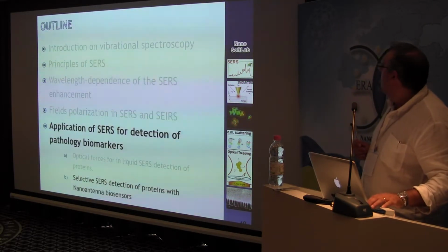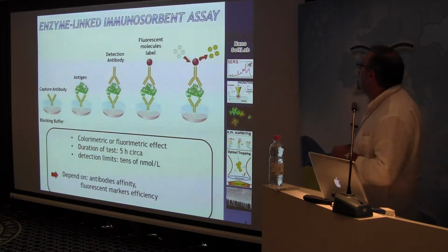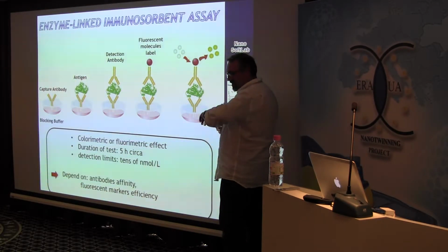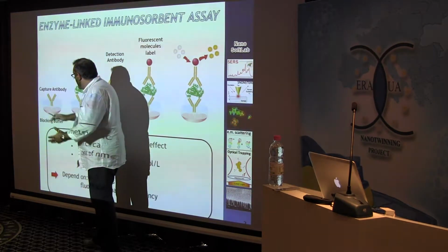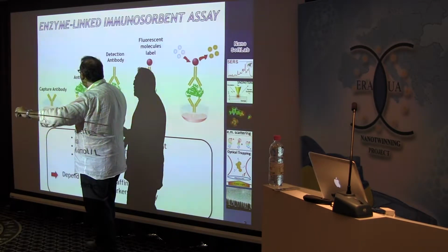I will concentrate on the main task of the nanoantenna project, that is selective detection of biomolecules. One of the most widely used methods is the enzyme-linked immunosorbent assay. You have your substrate, and you want to selectively detect a protein, let's say.